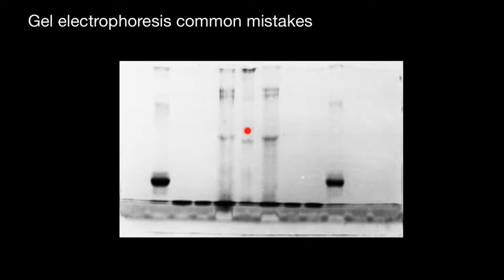Judging from the lack of other symptoms, it appears that the gel simply didn't stain well. Coomassie blue dye staining solution can become contaminated with SDS if it is recycled, and the dye becomes less effective and proteins don't show up as well as with the fresh dye. So what can be done in this case?